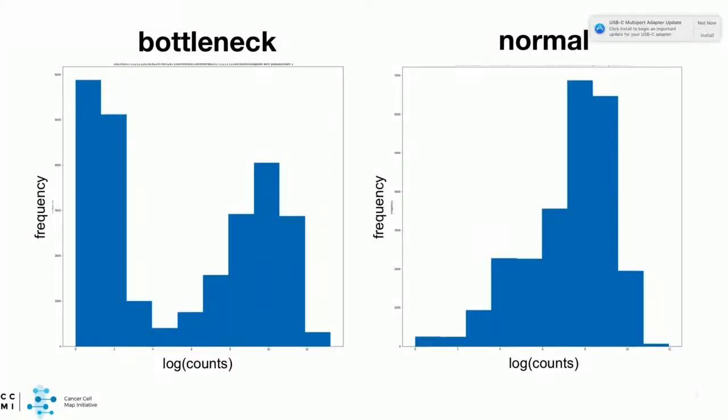And so again, talking about coverage, if your experiment bottlenecks at any level, whether at the plasmid level, the virus level, or the cell level, you can't get those lost reads back. Even if you sequence more at the end, if you've lost, say, half of the elements in your library, doubling your sequencing depth just gets you more reads on the half of the library that you have, because the part that's lost is gone.